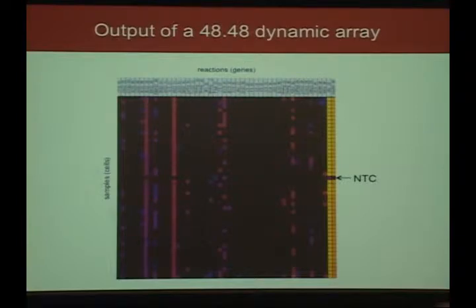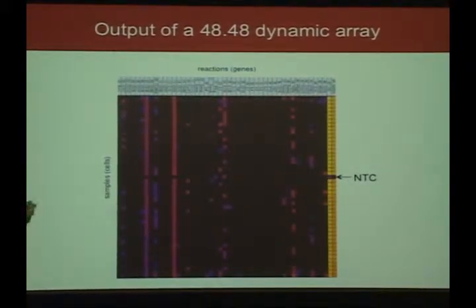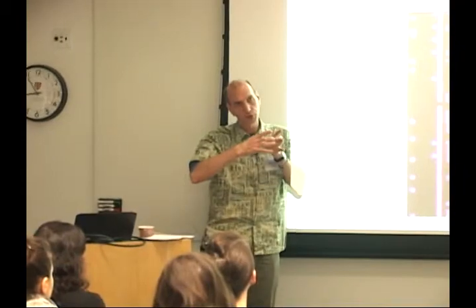Yes? I have a question, and it might be a dumb question, but how do you load only like 6 nanoliters? Yeah, you don't do that. So what you do is you load an excess into the wells that look like the 96 well plate wells, right? And then the instrument has all these little micro valves that open and close and create in that little center portion all of the different nanoliter chambers. And they're filled basically just because they have a certain capacity and there's a suction applied, and so they fill to that capacity.